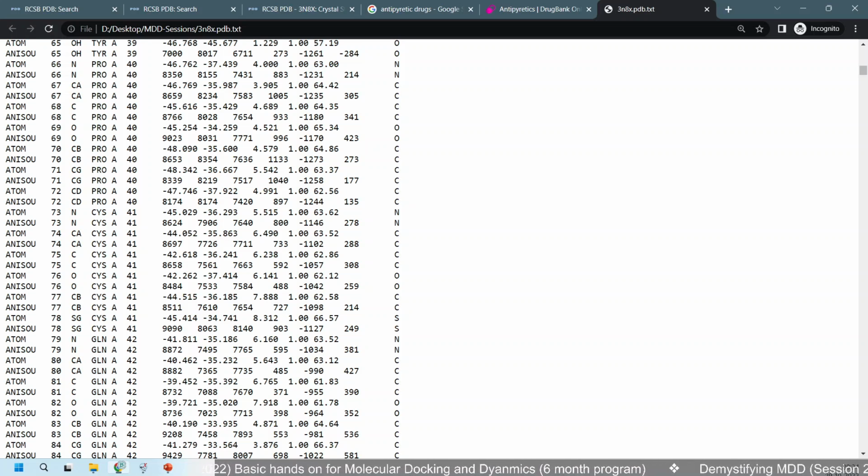I'm searching, where is it? Select any protein structure. There must be some ligand or other structures. Let's suppose this one. You should go to Select, then Select residue or structure, ligand.